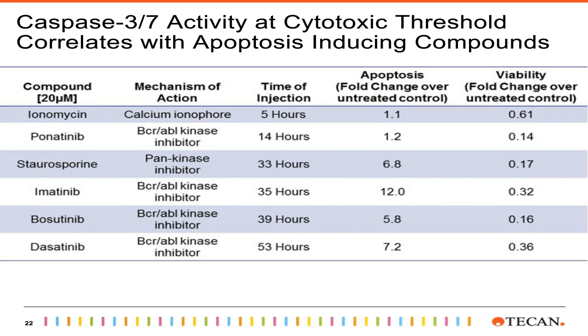So in the end, we concluded that, for proof of concept, it appears that the cytotoxicity threshold did work and that we were able to use this conditional injection of reagent to confirm the mechanism of action of our various test compounds.